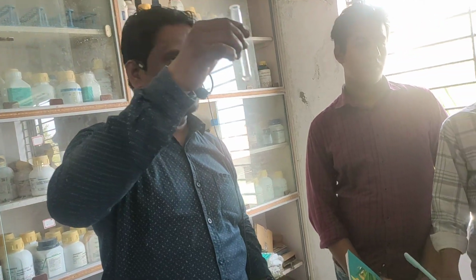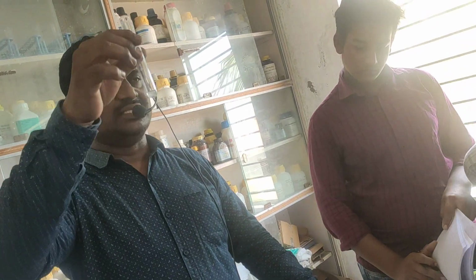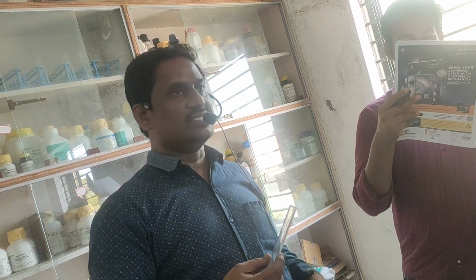Group table, let us go to Roman number 5. Identification of group for basic radical. The acid radical is completed now, so we are going for the basic radical.